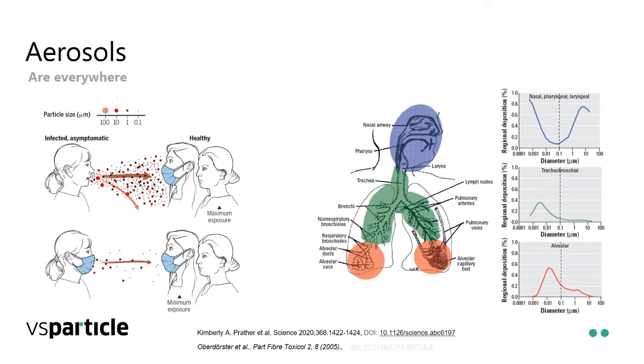Or you could have a malign particle floating in the air very effectively deposit in there. So it's important that we understand how these aerosols work. And for those that are not familiar with them, I will dive a bit into some basics on that.